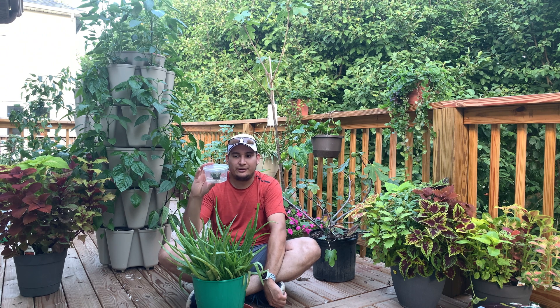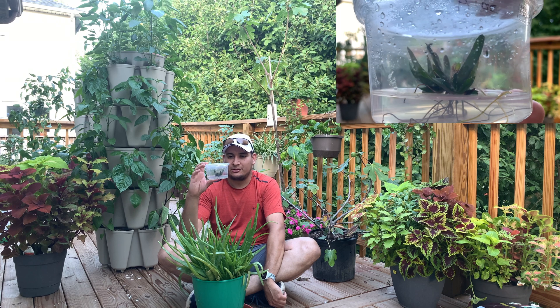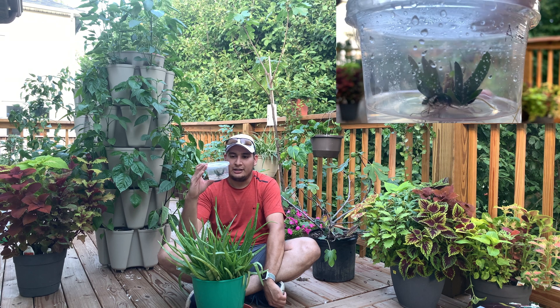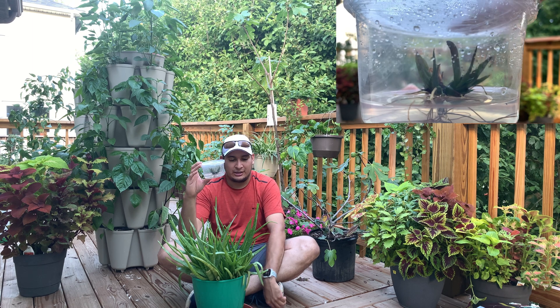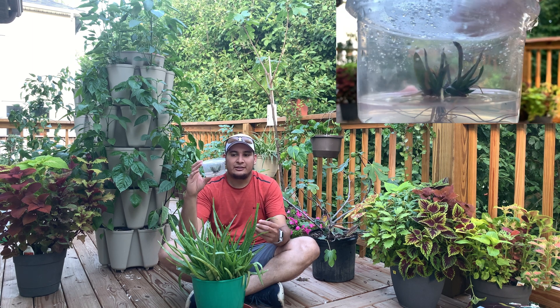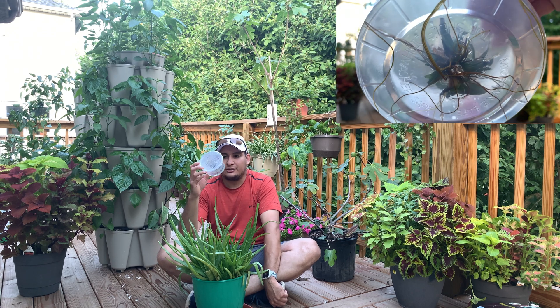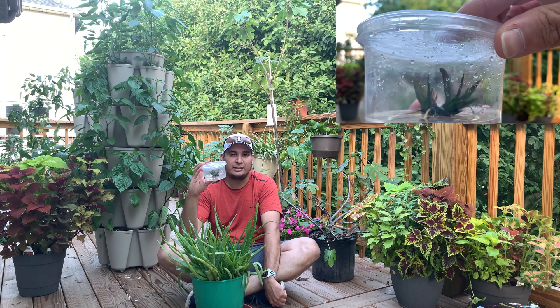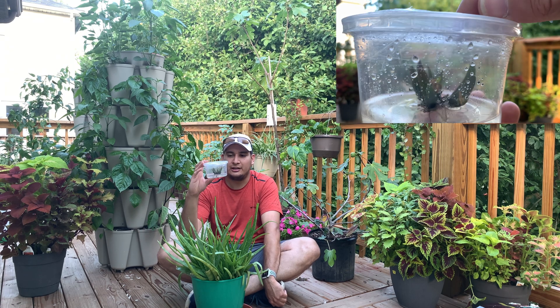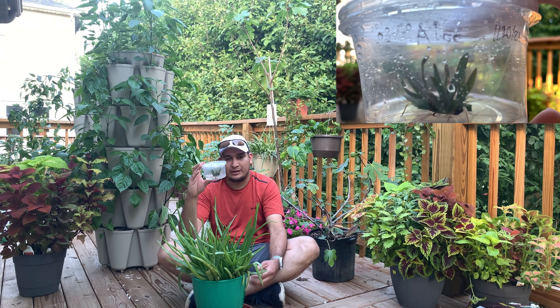It's doing very well. It has a good amount of propagation and you can see some of the leaves have already shown mature aloe vera characteristics. I'm very happy with it. It has a good amount of roots and the media — there is no contamination. I never got any issues with contamination with this plant.